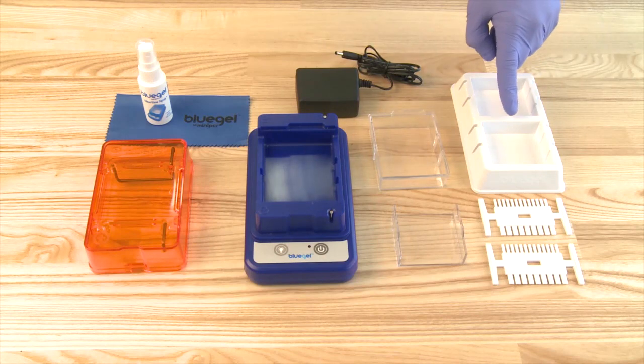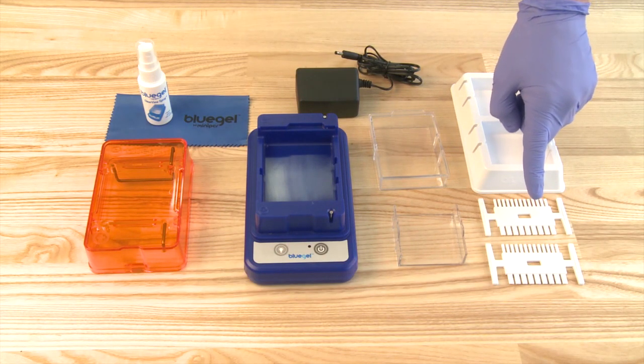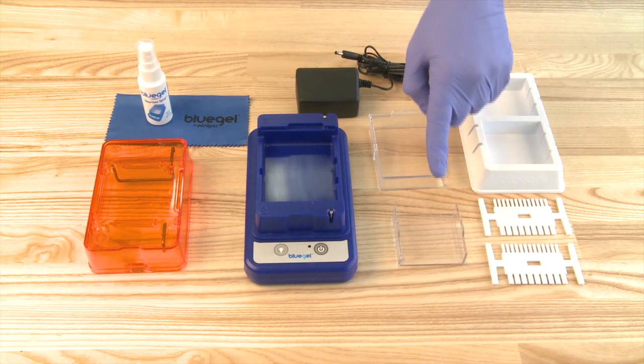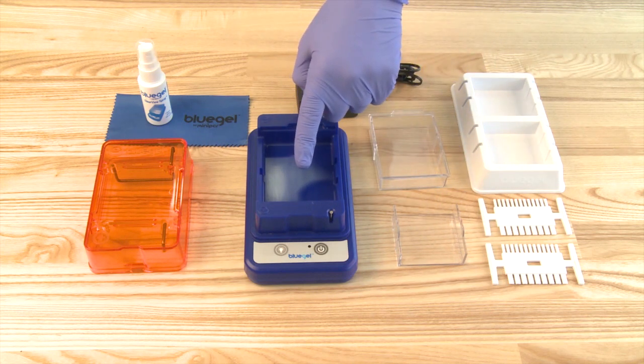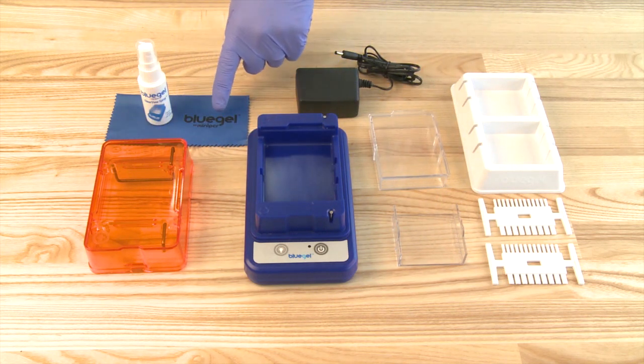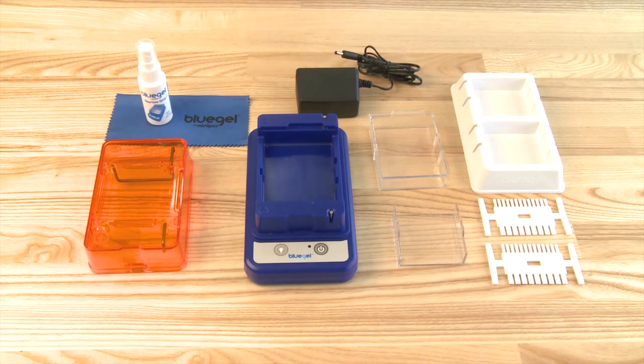Your system includes gel casting platform, two combs, a buffer chamber, a gel tray, a blue base, an orange cover, a cleaning cloth, clear view spray, and a power supply.